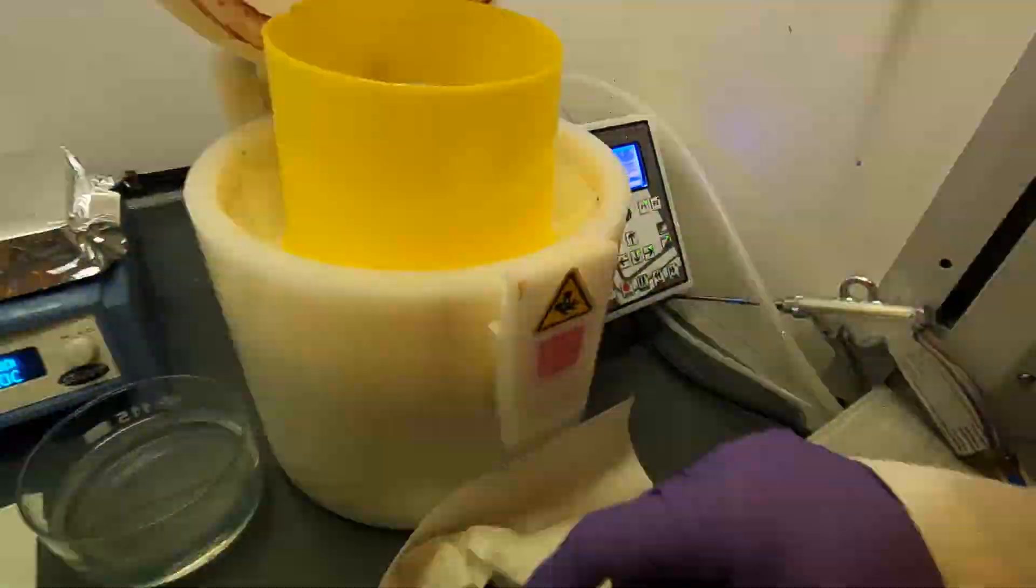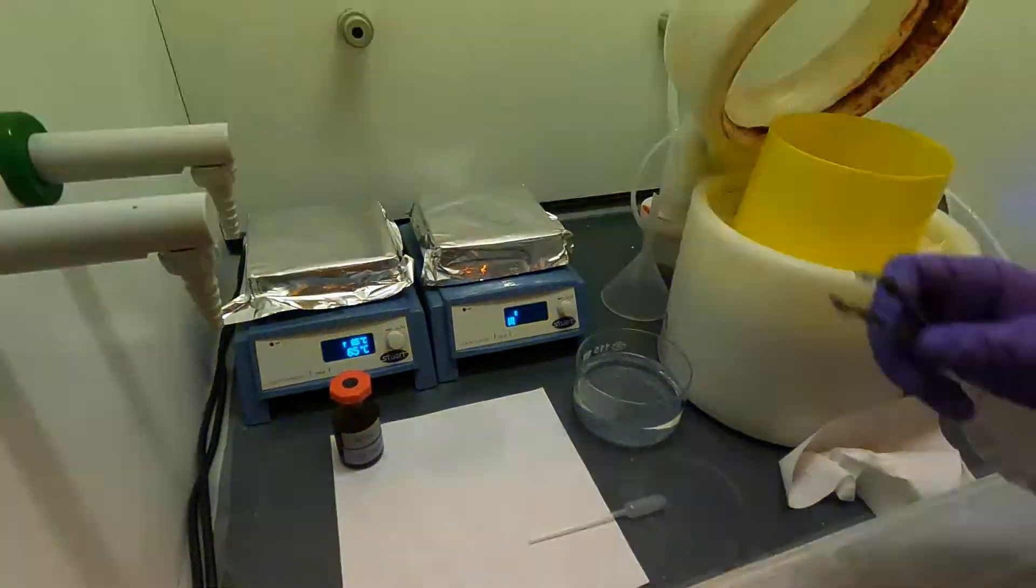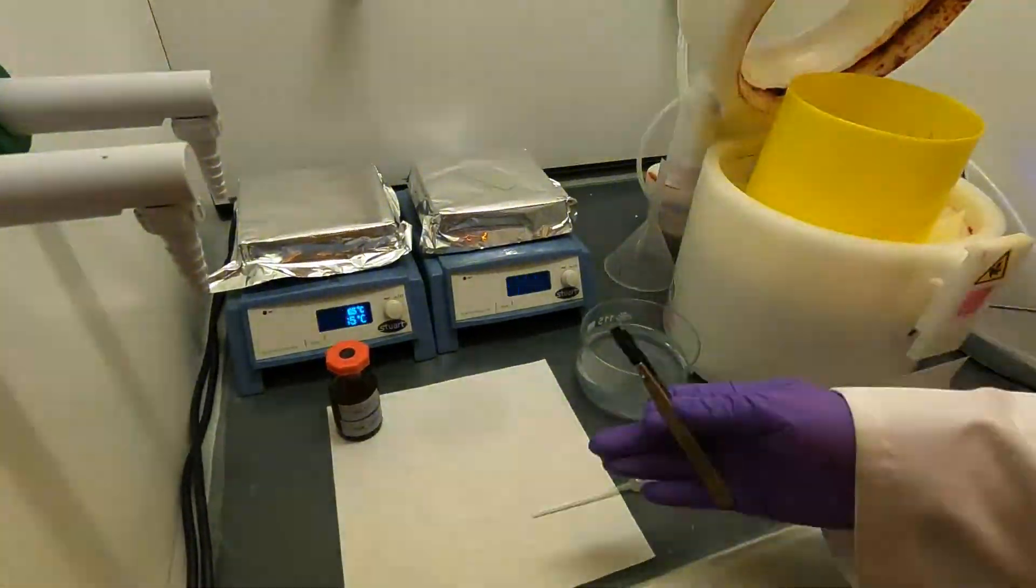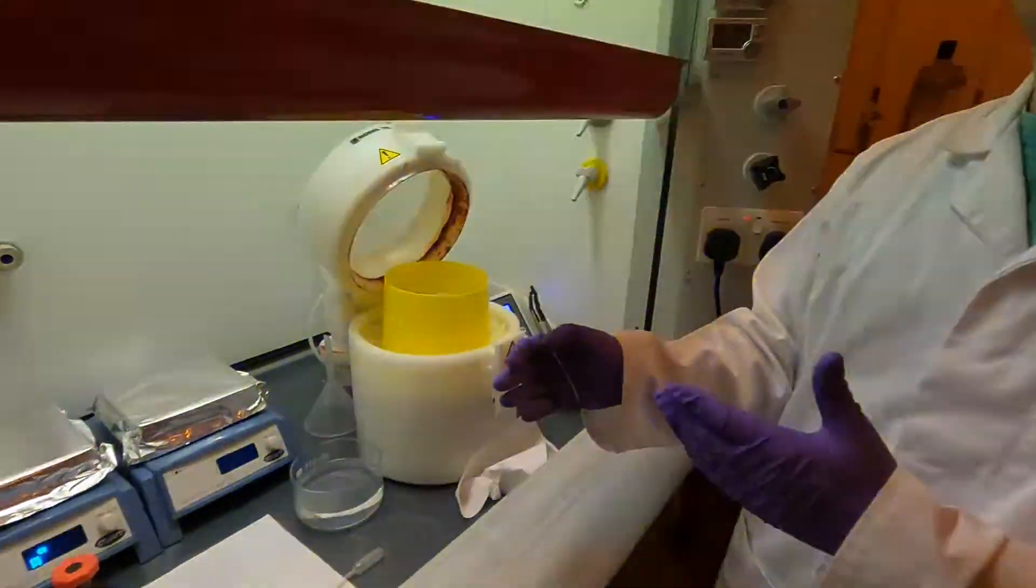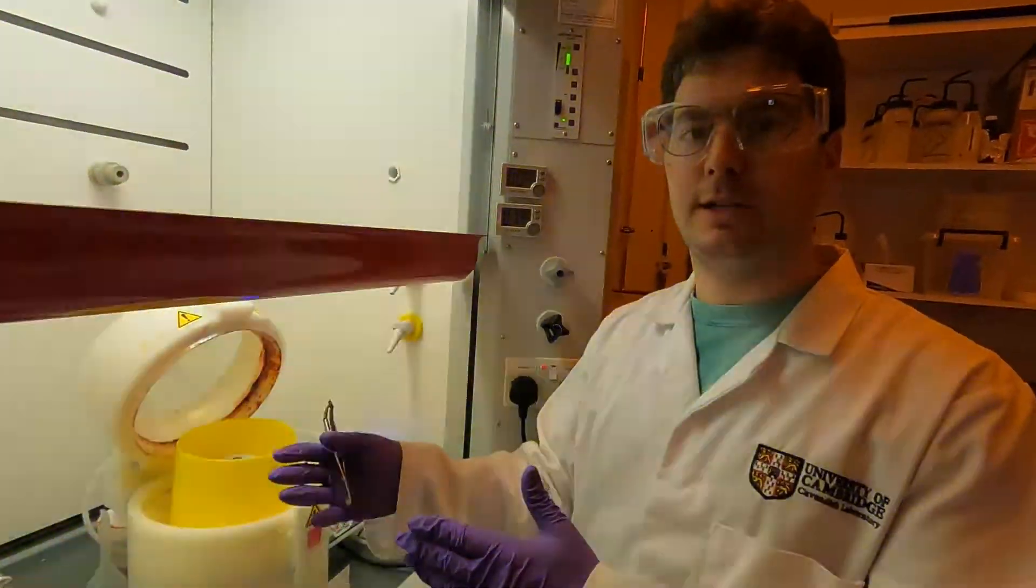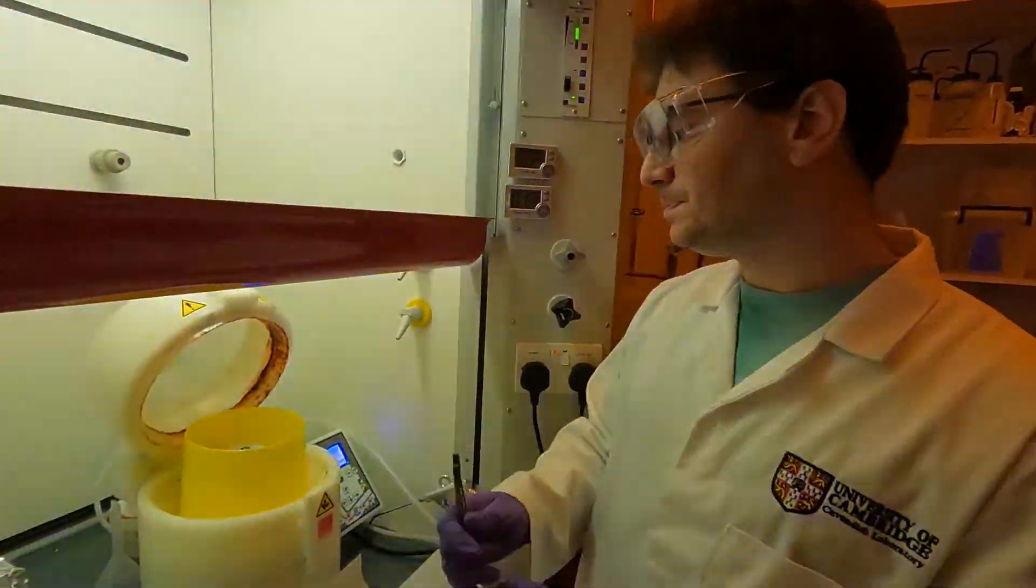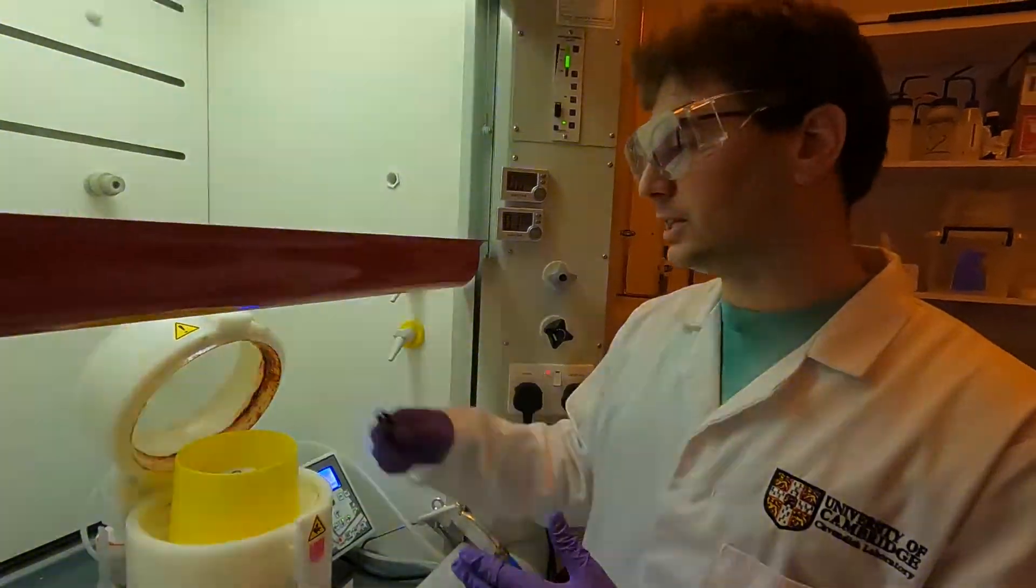The next step will be to quickly get the sample off the hot plate and leave it to cool down. We want it to cool down for about 90 seconds, this will get the sample from 200 degrees to approximately room temperature, and then we'll be able to put it in the spin coater.